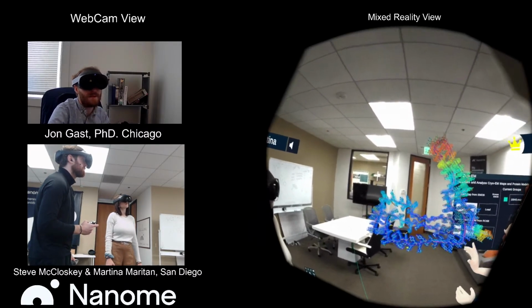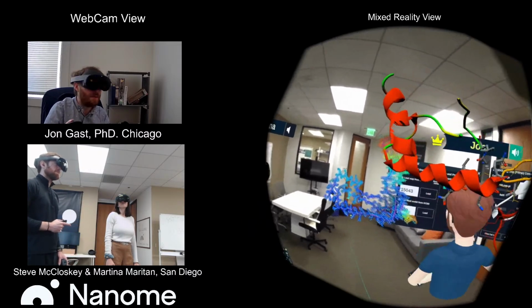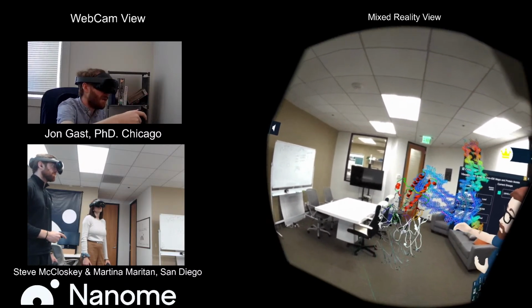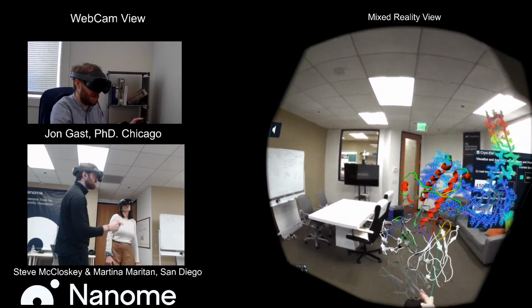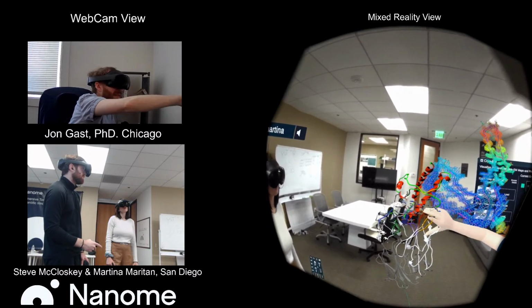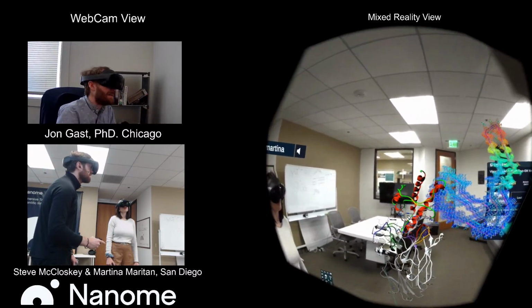And one great thing that we've been seeing pop up again and again with treatment of prions are antibodies that are going to try to bind to these and prevent this incredibly stable structure from forming to begin with. Trust me, this actually is that same prion, but we're seeing that it completely changes the folding entirely through the stabilization of the antibody binding in a few regions. So no more big beta sheet sets that can really stack nicely. Now you have these alpha helices that are also stable, but are just being held in place by this antibody.